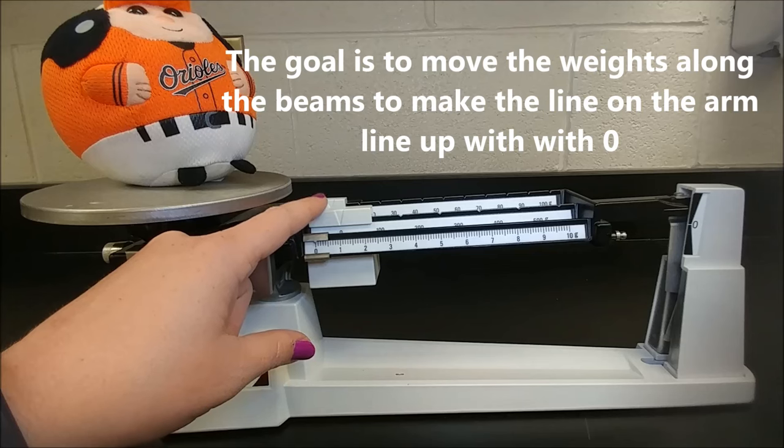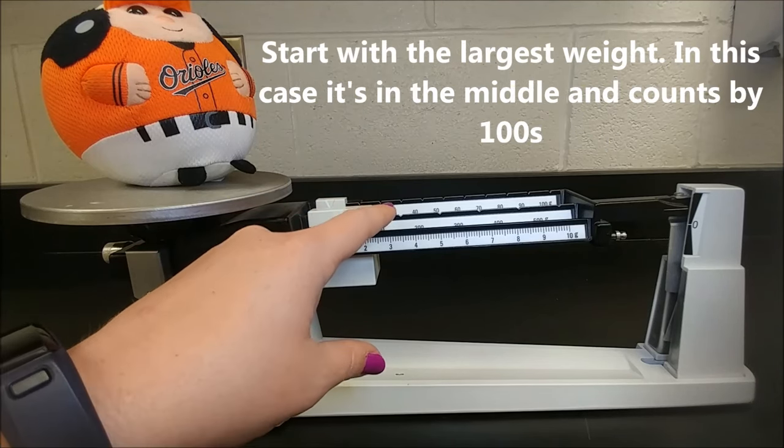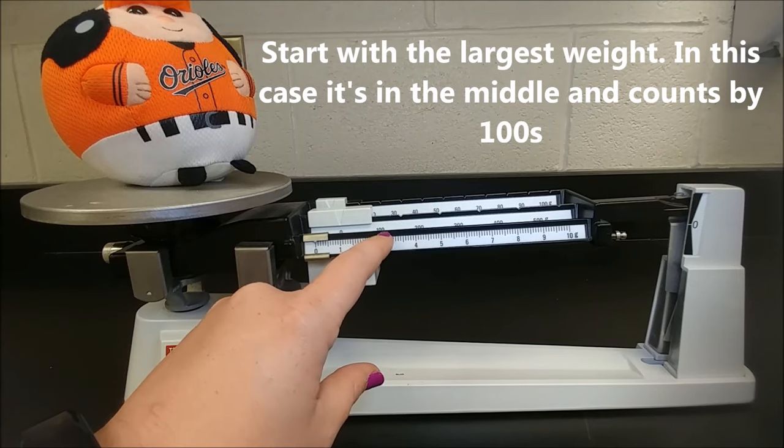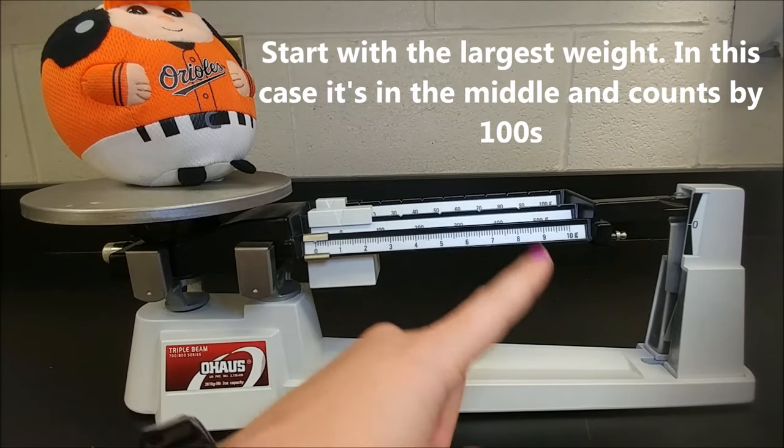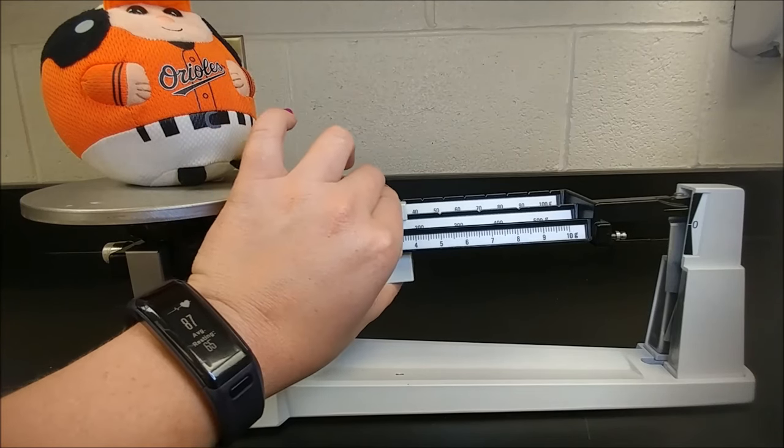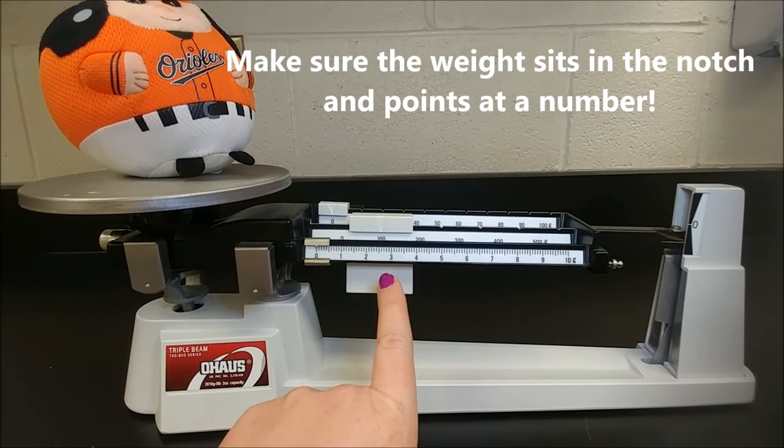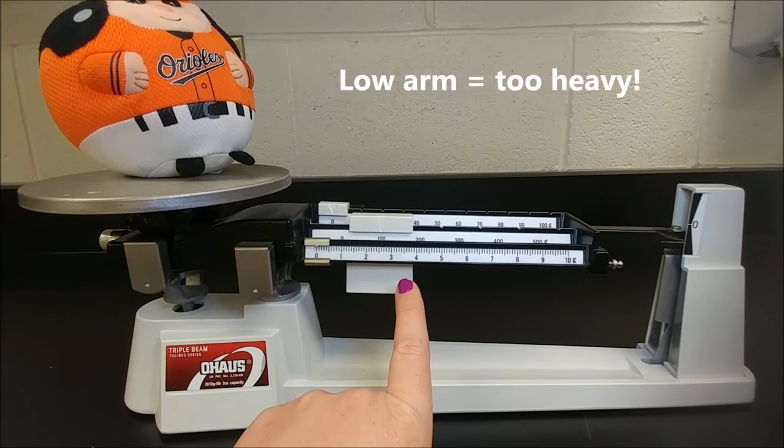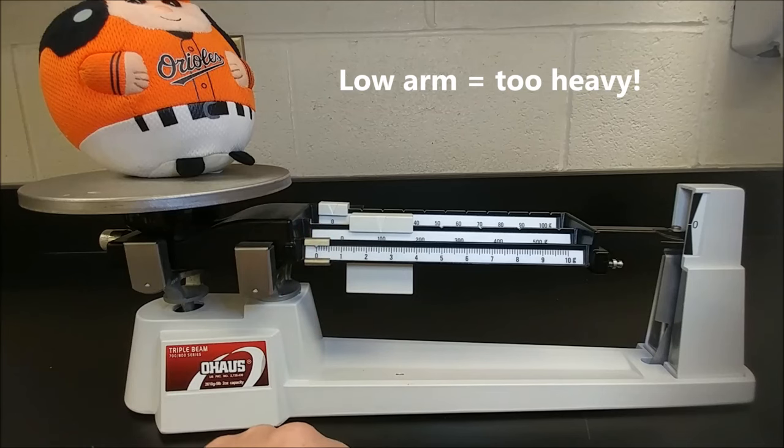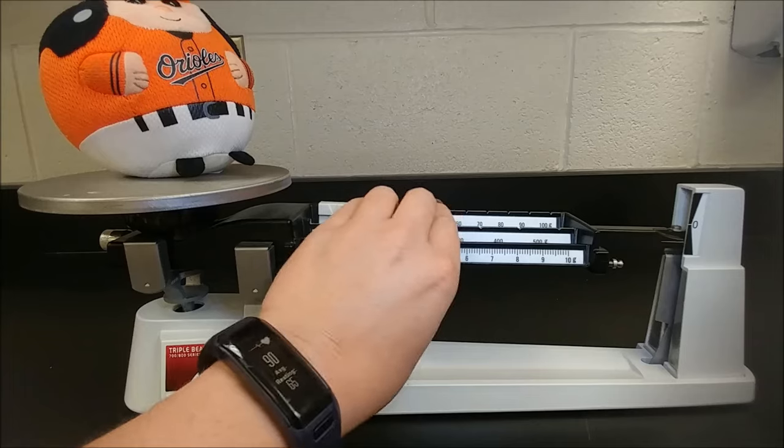We always start with this middle bar. This is the one that measures by hundreds. You can see each notch has a different number on it. The next notch is 100, then 200, then 300, all the way on. So I'm going to move this first to the 100. Notice how the arm dropped to the bottom. This means that number is too big. The Oriole bird ball actually has a mass that's less than 100, so I'm going to move that back.